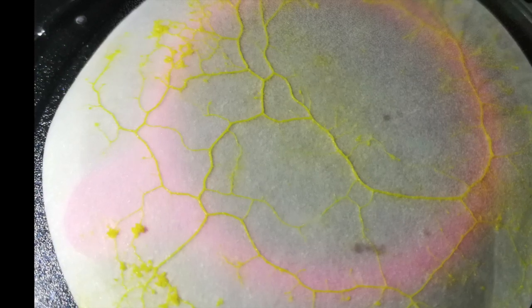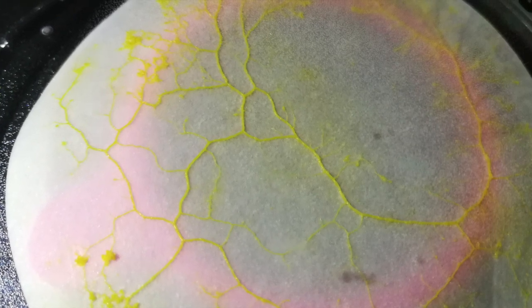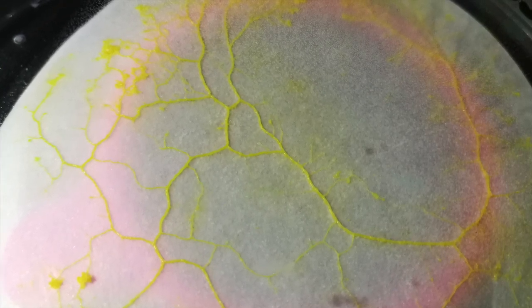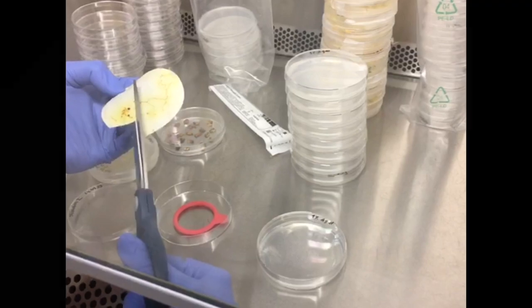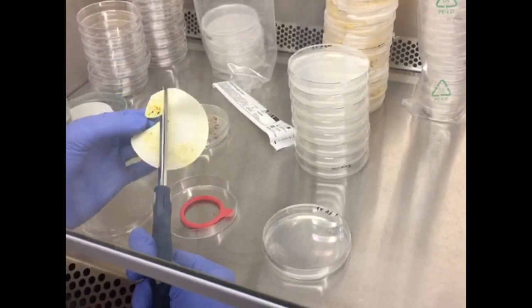To ensure a stock of long-term stages of P. polycephalum, we produced some sclerotia. A piece of overgrown agar or oat flake was placed onto a sterile filter paper in a petri dish. To ensure initial growth of a plasmodium, the filter paper is moistened and oats were added. After two days in the incubator, all nutrient sources were removed. Then it was stored until the filter paper was completely dry. For reactivation of the sclerotium, only some drops of water need to be dropped onto it.